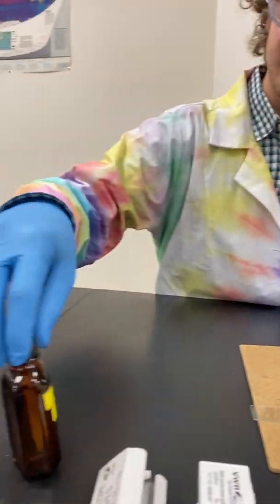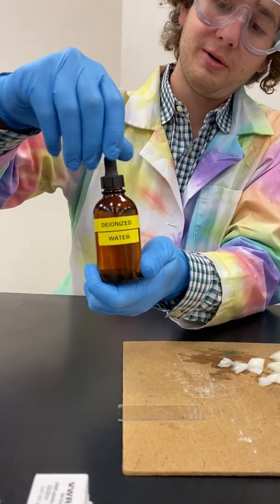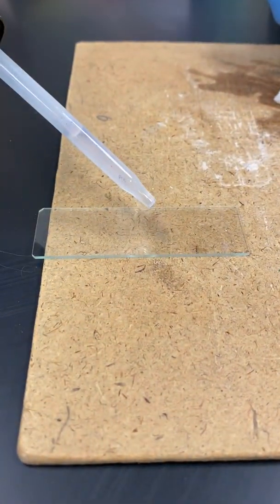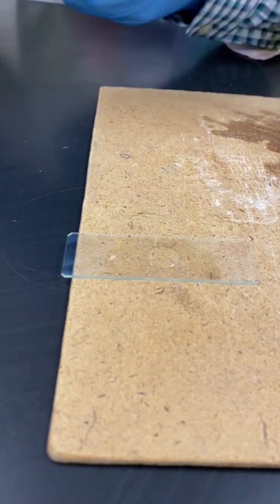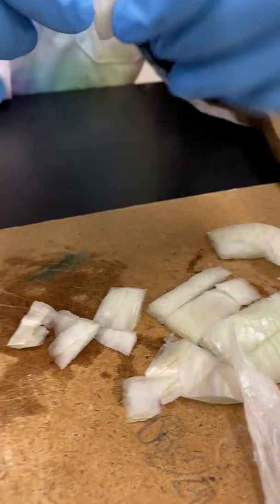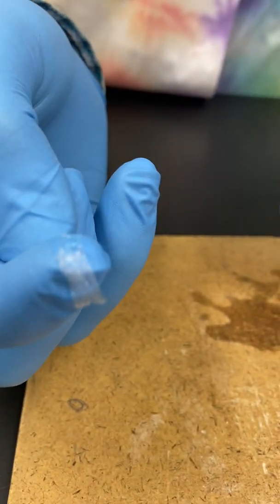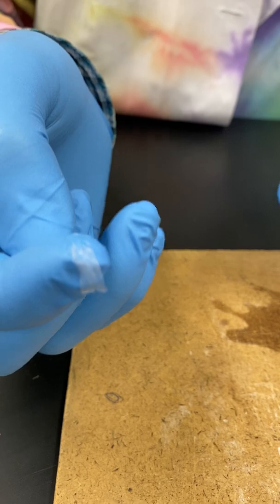The very first thing we want to do when making any of these slides is start with a drop of water. Next, we need to procure our specimen. We're going to be using onion. You want to tear off the skin from inside — you want it to be as thin as possible, and a hunk that big is plenty.